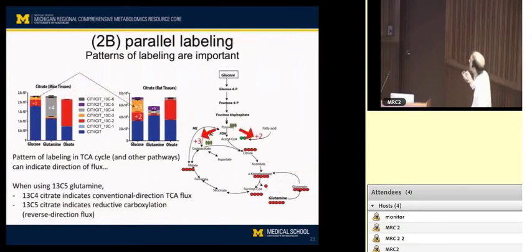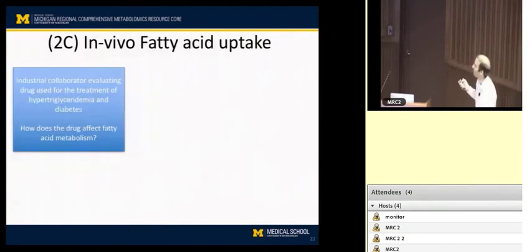And yes, okay, so further you can look at where the oleate is going as well, whether pyruvate is forming acetyl-CoA or whether you're going through another pathway to oxaloacetate from 3-carbon labeled. There's that example of where I wasn't prepared to discuss Mahmoud's data.